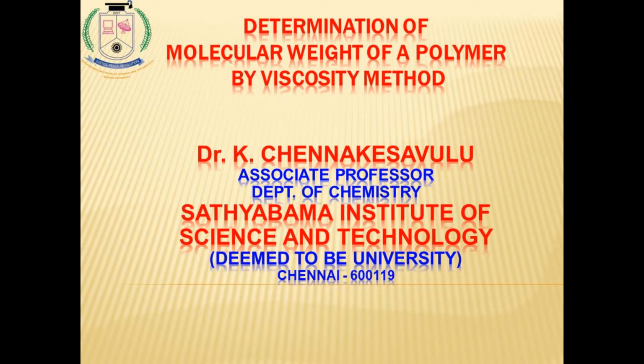Good morning to all. Let us discuss the determination of the molecular weight of a polymer, that is polyvinyl alcohol, by the viscosity method.